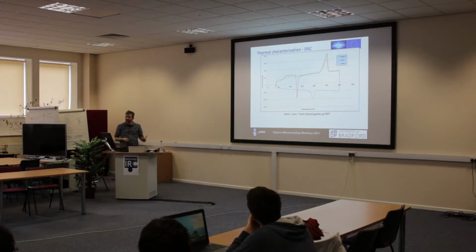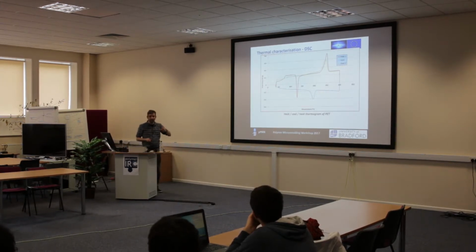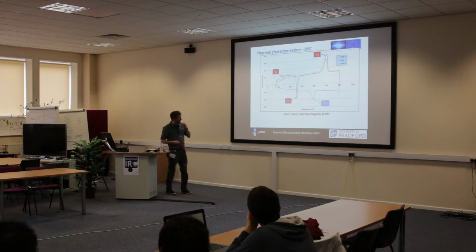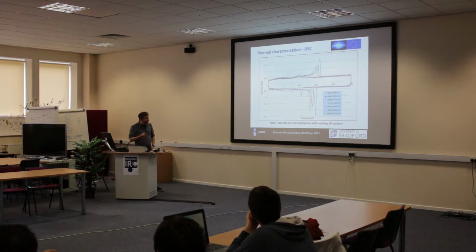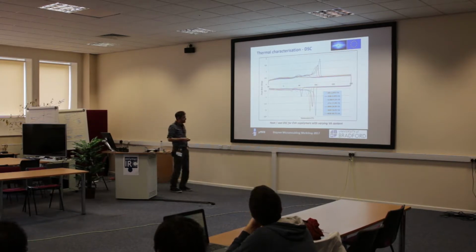So these are single materials. A lot of materials we use are blends, so you can imagine how these curves get pretty bad pretty quickly. When you look, this is the materials I showed the rheology on yesterday, sorry, it's been a long week.